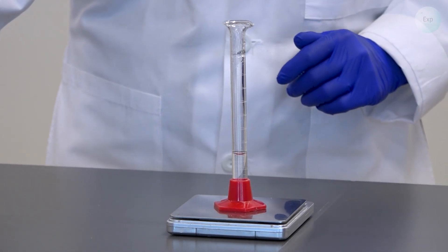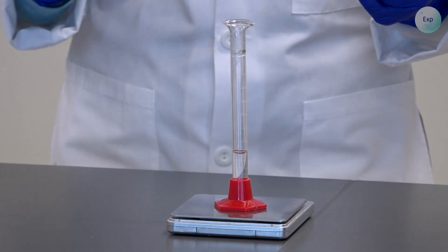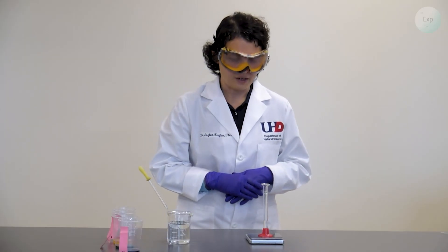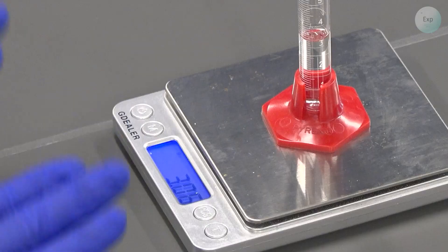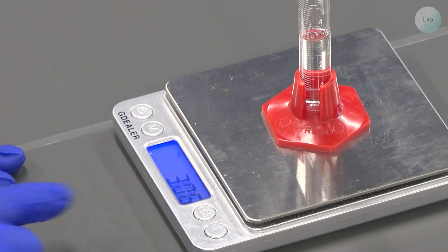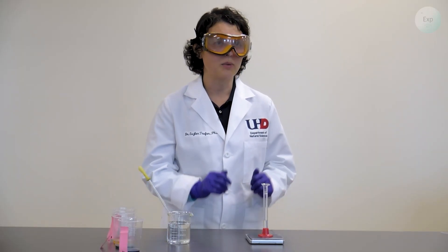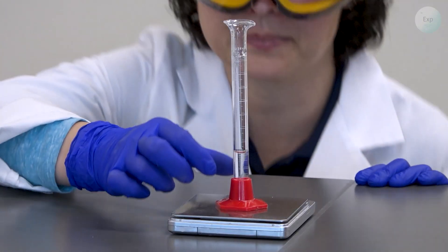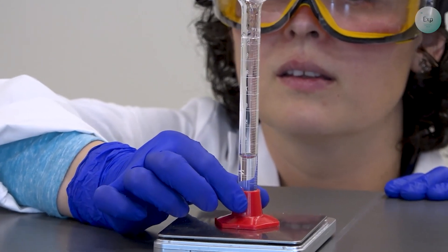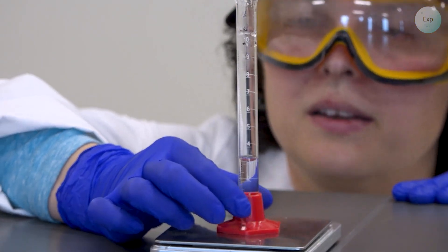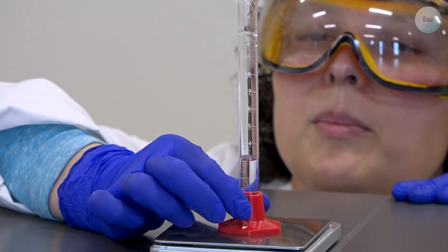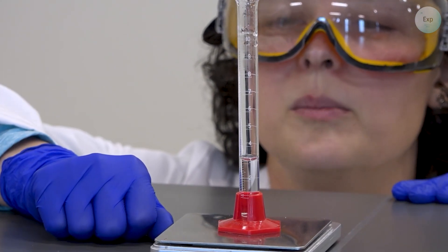For our first measurement, let's aim for a volume anywhere between 3 and 5 milliliters. So we record first the mass. For me, it is 3.06 grams. And then we lower ourselves down to eye level and record the volume of the same amount of water. And for me, that will be 3.08 milliliters.